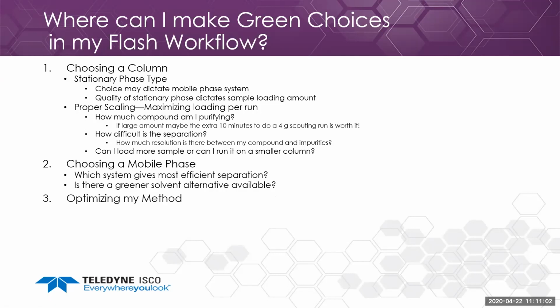And finally, what we could ultimately do. This takes a little bit more time, but it's something that can yield benefits and time savings later if you're doing multiple purifications of the same compound. Are you interested in one or multiple compounds for your purification? If you're only interested in one, we can really focus the purification around maximizing resolution around that compound. If you're interested in multiple compounds, then we probably need a longer method, a longer gradient time, so that we can separate those out.